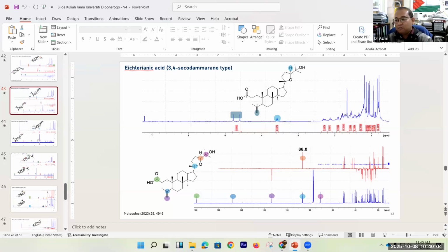But for the previous compound isolated by Zol and also Adi, we managed to determine the compound very fast at that time. If you remember, the major compound with the sugars, rhamnose or something like that. I hope the NMR is still in progress, because we are doing trial and error for that. I hope we can discuss in detail later, Pak Pinos. Okay, thank you very much.